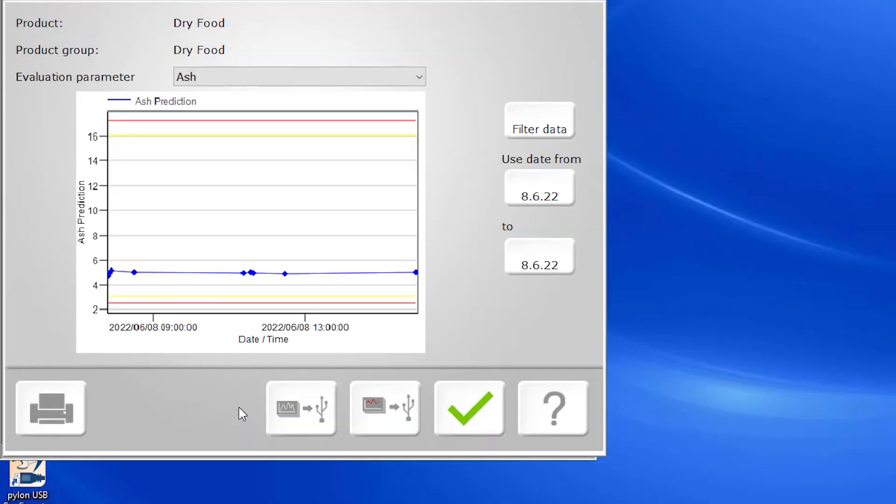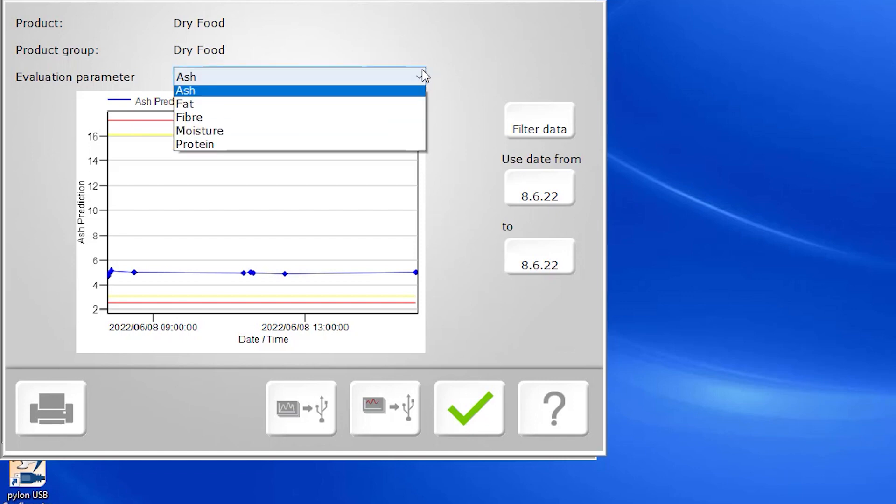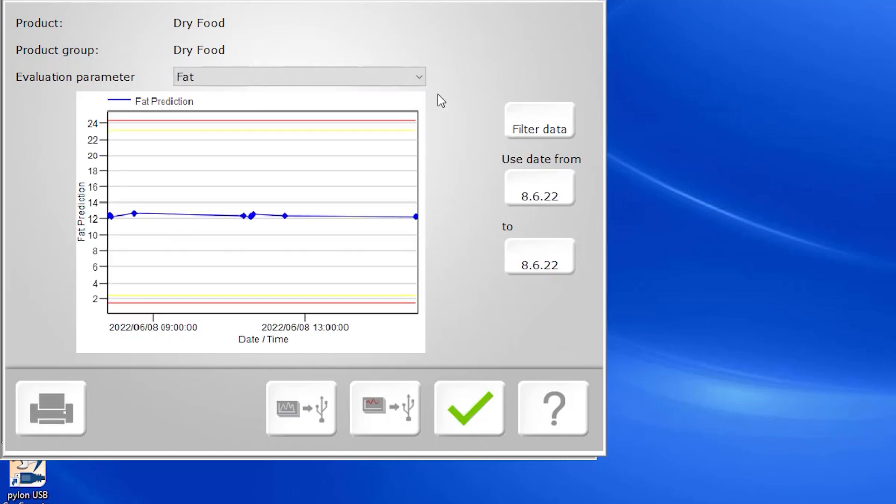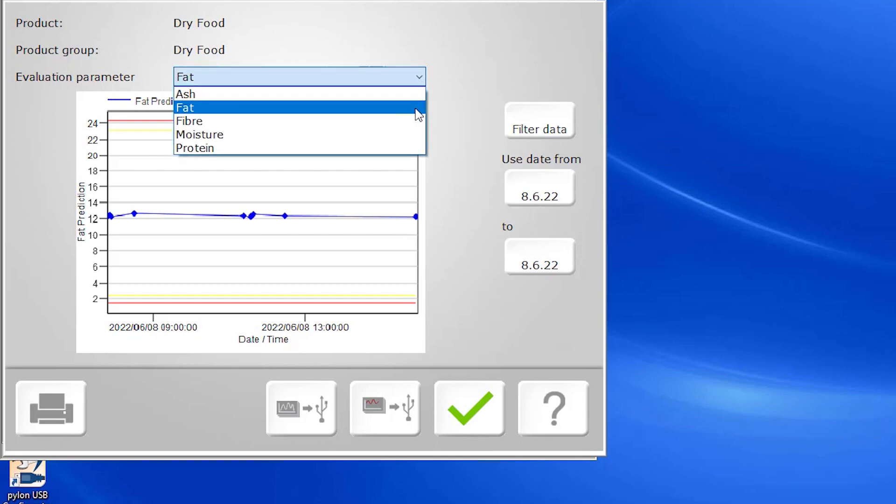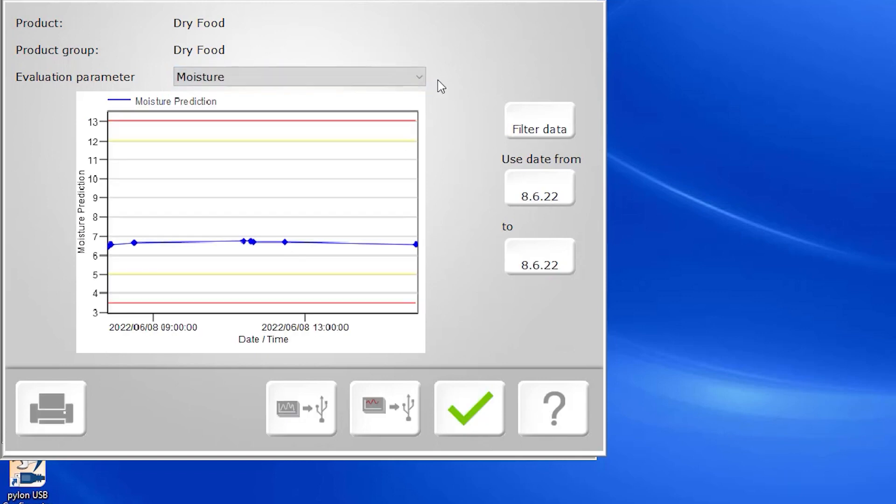in which the red lines represent your maximum minimum lines throughout a spec, the yellow lines represent your maximum minimum cautionary limits, and any values that fall in between are your acceptable ranges.